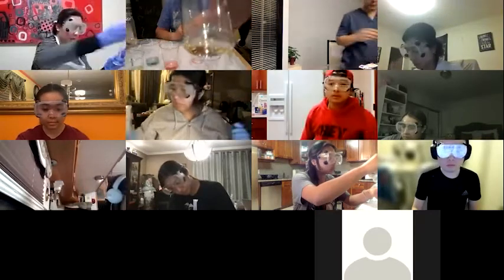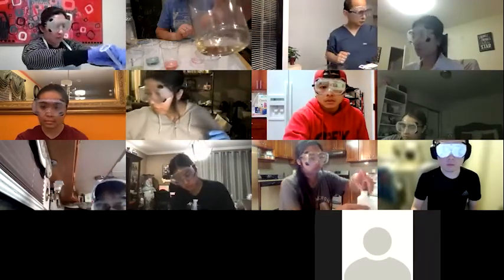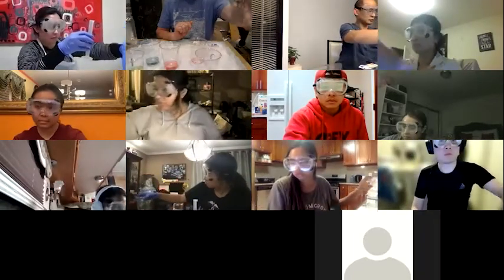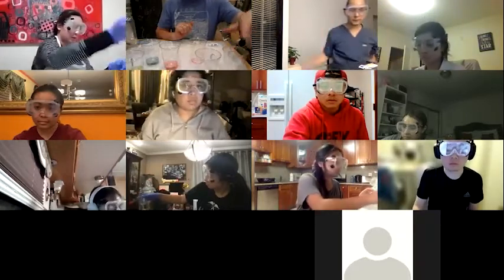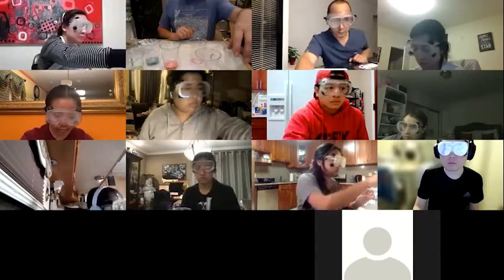And the 5.7 buffer looks more like the water, sort of like a yellowy color. Actually, because pH 6 is yellow. So that's the pH it should be. So your pH 5.7 buffer should be looking like pH 6. It should be yellow.